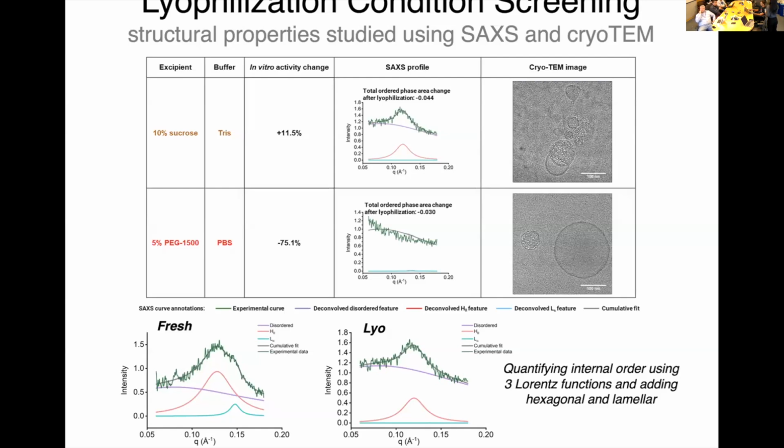Oh, okay. So generally if you increase the flow rate, the mixing occurs more quickly, and that tends to also start the encapsulation process more quickly. So I want to say at least a smaller size, unless you leave it out and it starts reorganizing itself, and things might combine together and create a larger particle. But generally with the flow rate ratio that we were looking at, if you increase the flow rate, that leads to smaller LNPs with more encapsulation of the nucleic acids in the lipid compartments. Does that answer the question? Yeah. Perfect, thank you.